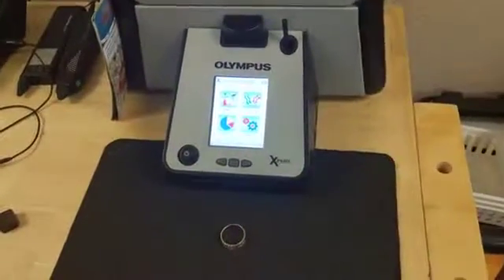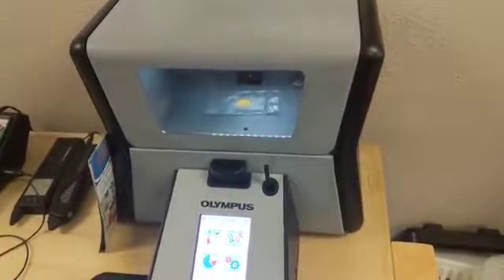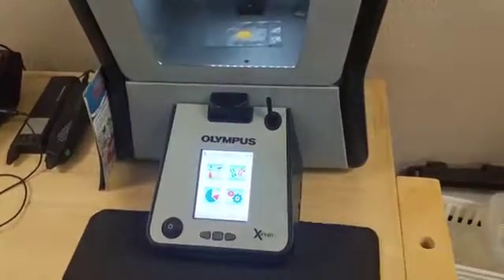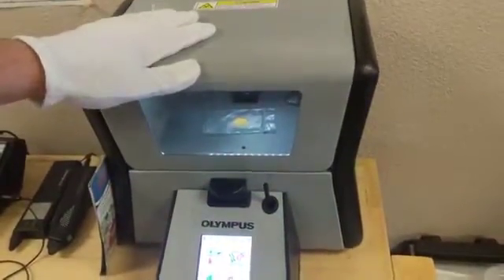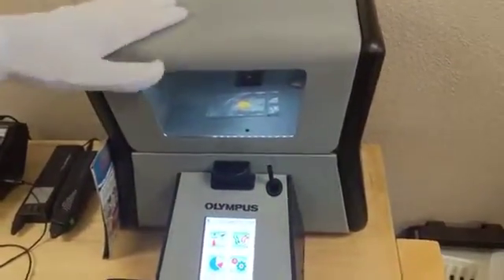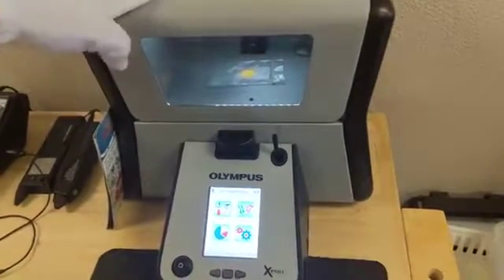Hi, it's Evan again from Texas Gold and Silver Buyers. As we stated in the previous video, we do not do destructive testing here. We use the Olympus Gold Expert XRF x-ray. It's highly precise — it's the gold standard in the industry. It does non-destructive testing.